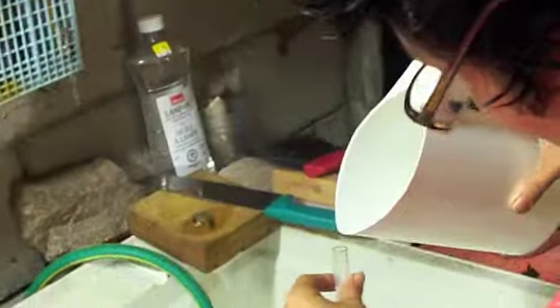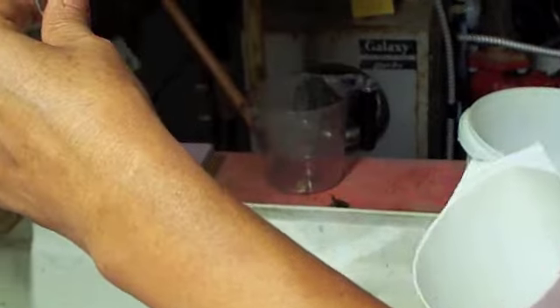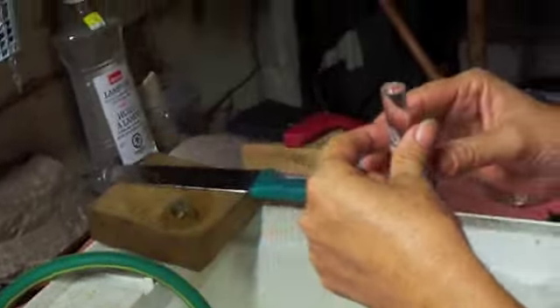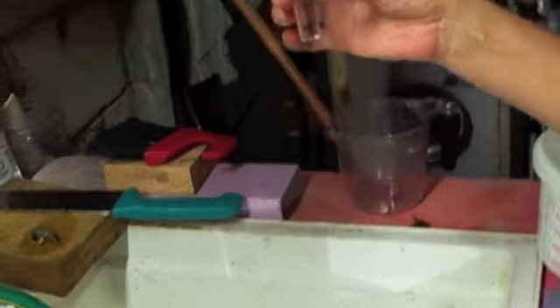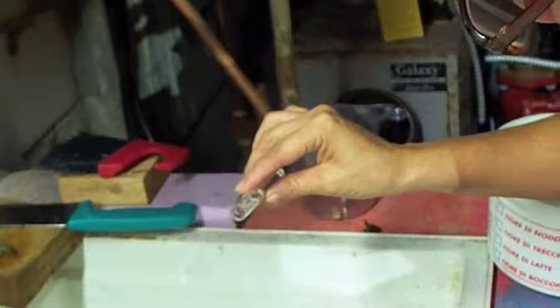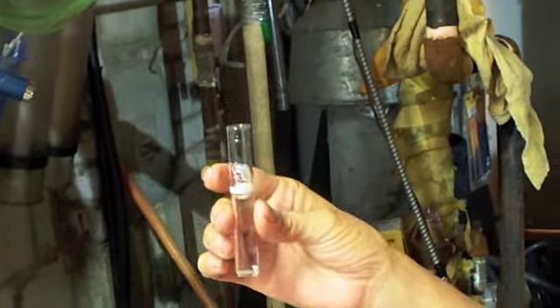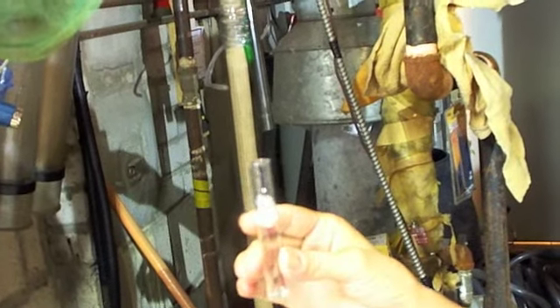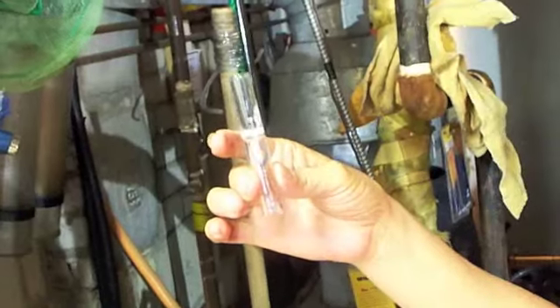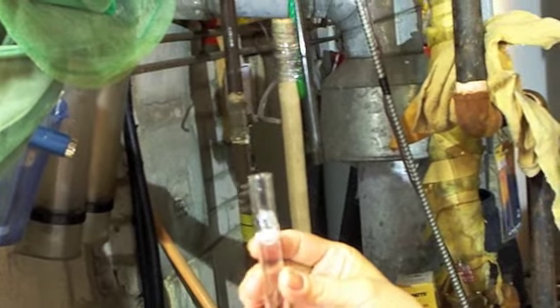Do I have to fill it up to the top? You fill it up exactly to that line. To which line? The line that's underneath your thumb. Oh, okay. So now what are you going to do? You're going to pull water out. Okay. Now you want the bottom of the meniscus to be even with the line. Which one is the meniscus? The meniscus is, you see how the water curves up on the sides and it's lower in the center? Yeah. That's a meniscus. You want the bottom part of the meniscus to be even with that line.